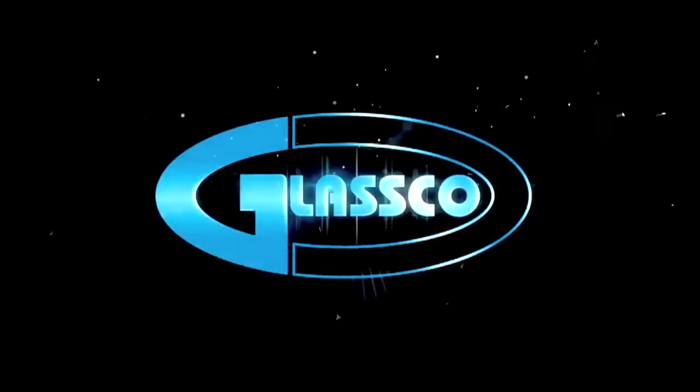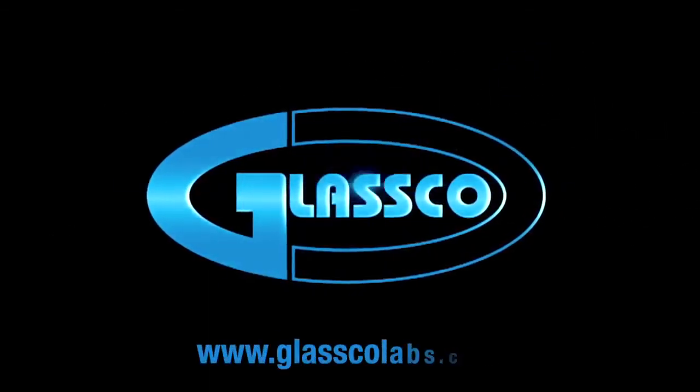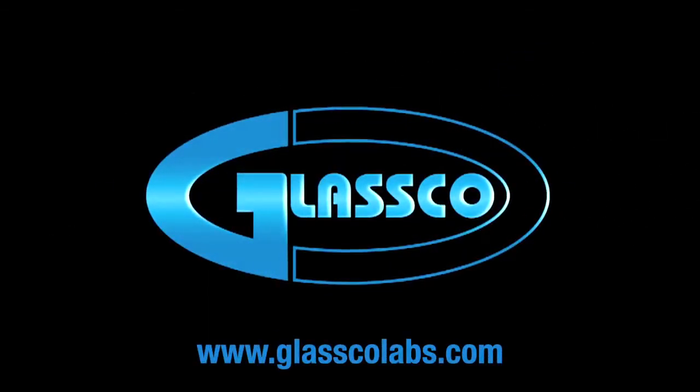Glassco Innovations. For more products, visit www.glasscolabs.com.